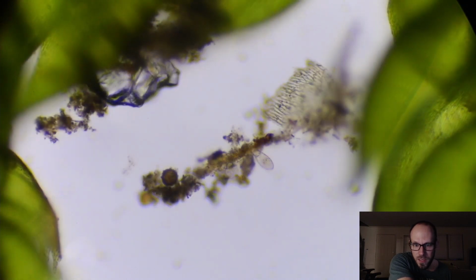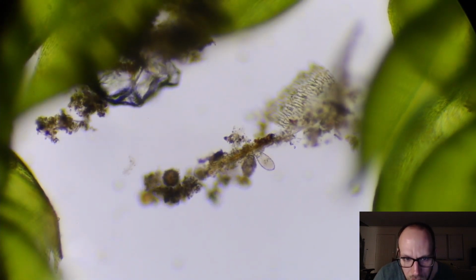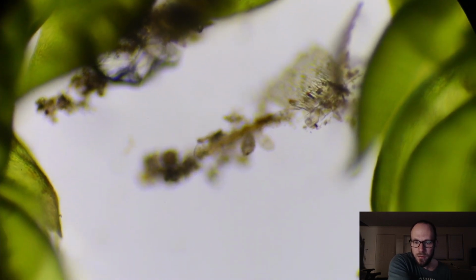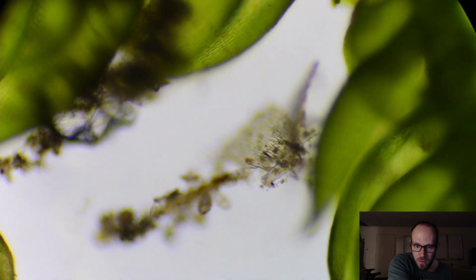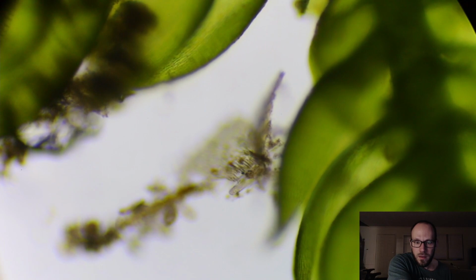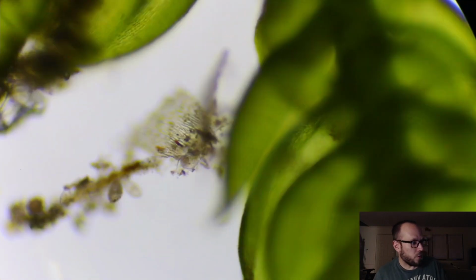I want to take a look at this guy. Is that a guy? I don't know what that is. He needs to come out from behind there, to be honest. We're not going to be able to tell. I don't think it's a rotifer. I've had this thing for over a month. We're going to go 400x here. And I am rotifer-free. No rotifers to be seen.